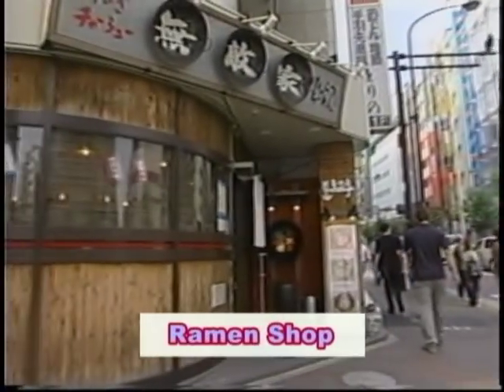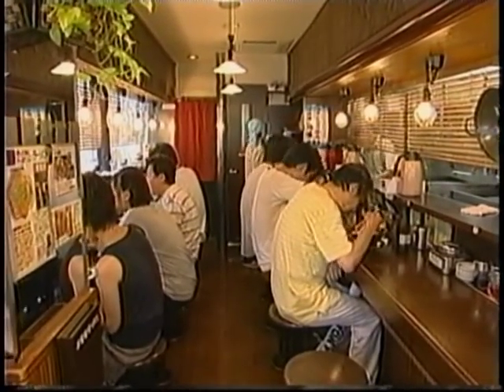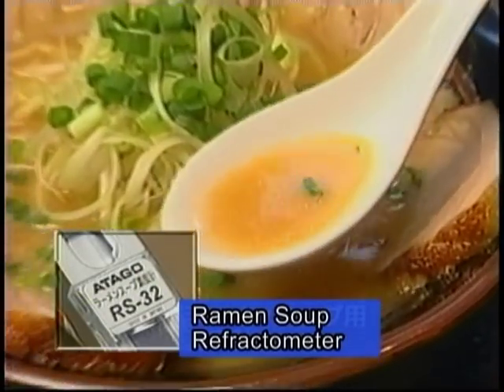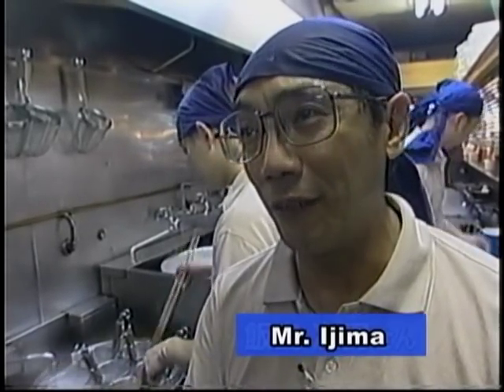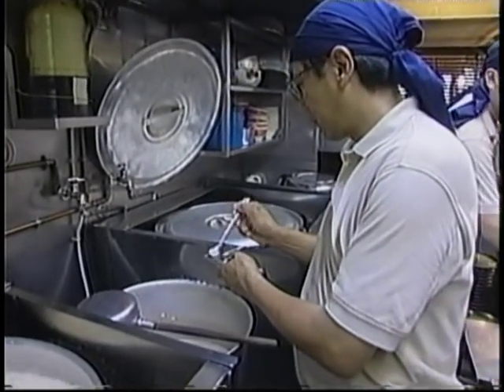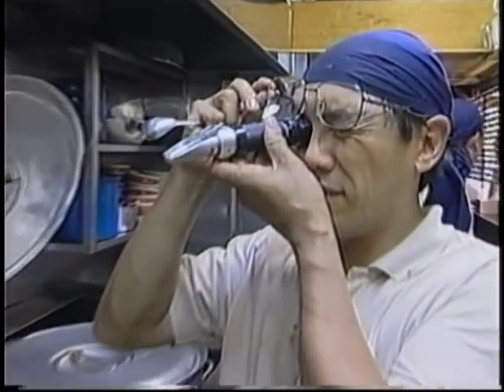Furthermore, Atago has developed their own completely original refractometers, such as the beef bowl sauce model and the Chinese noodle soup model, which enable the control and maintenance of taste. If we rely on our own sense of taste, it is sometimes affected by our day-to-day physical condition or by the climate. We use Atago's refractometer to serve with a consistent taste.